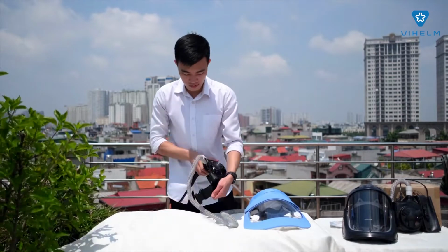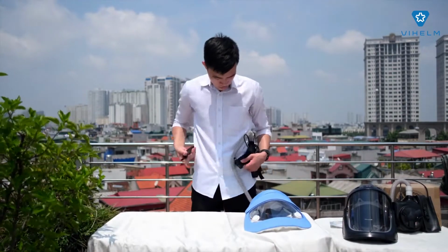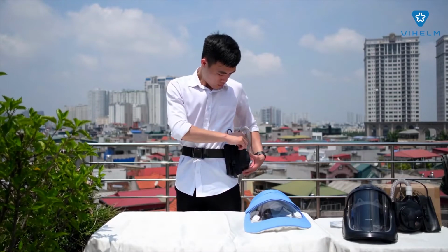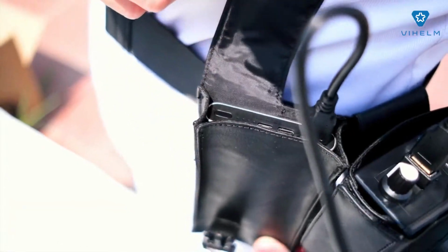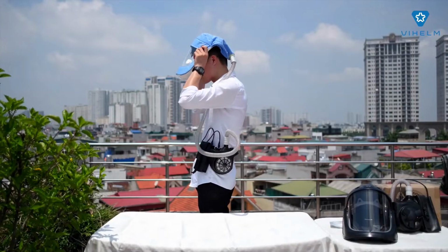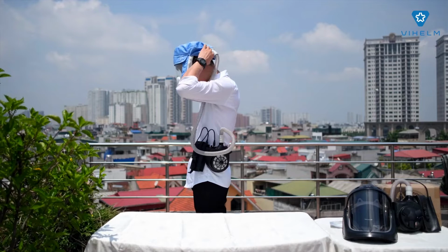Step 1. Put on the suspension belt with the blower pouch and the battery pouch attached. Step 2. Turn on the battery by pressing the button on the battery. Turn the knob on the blower to adjust the wind speed. Step 3. Raise the Vihood up to your face, put your head into the hood.